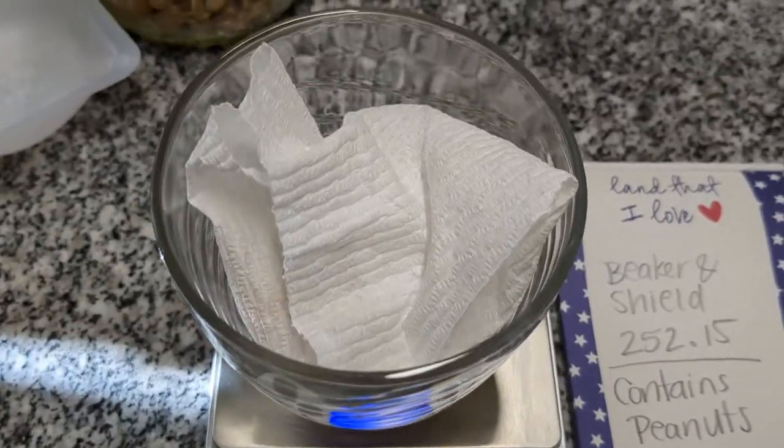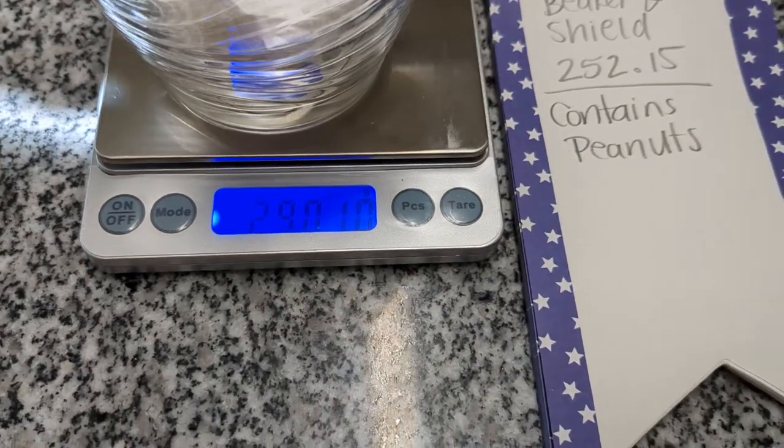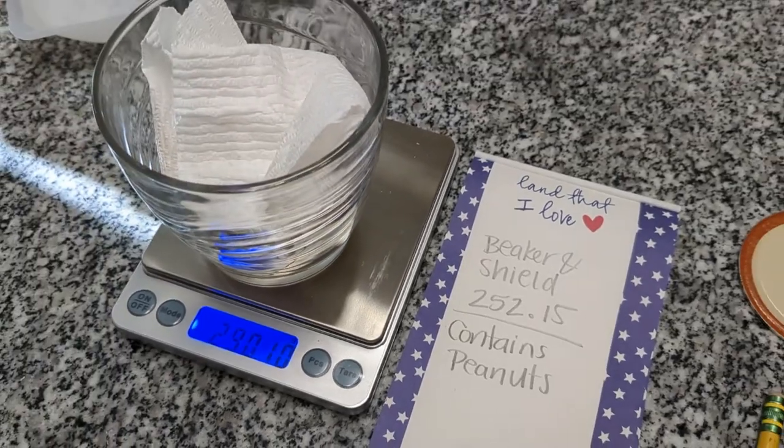You kind of get what I'm saying here. Again, you can do this with anything that you have in your classroom. It is a lot of fun for the kids. It really helps to solidify the mole concept, even before they learn what a mole is. I like to do this on the very first day of my stoichiometry unit, kind of to get them to see where I'm going with the mole, because that number is just so big it's hard to wrap our brains around. But when they have this kind of inquiry lab as the background for the mole concept, the mole clicks a lot faster.